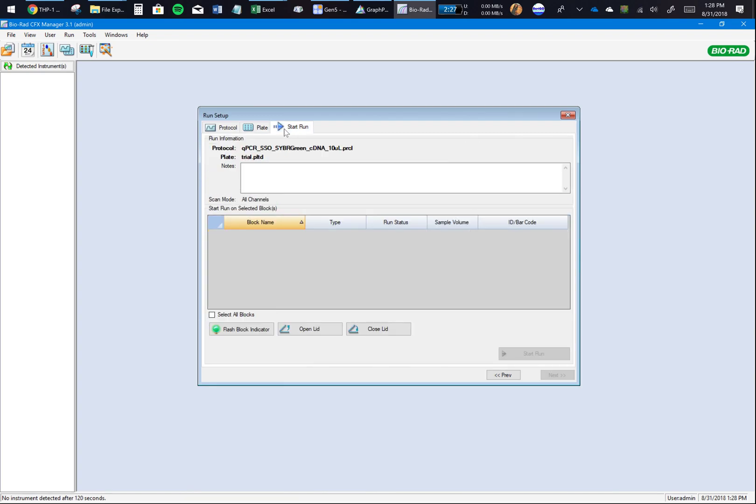Now you'll go to File, Save As. This will be your plate file. You can save it with any name, whatever helps you identify. I'll save it as Trial. That's my Trial plate, and you're almost set.